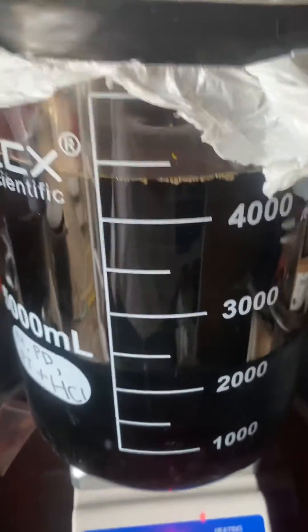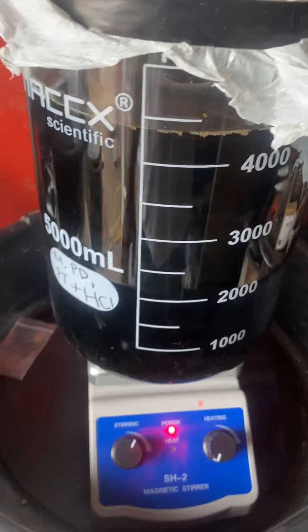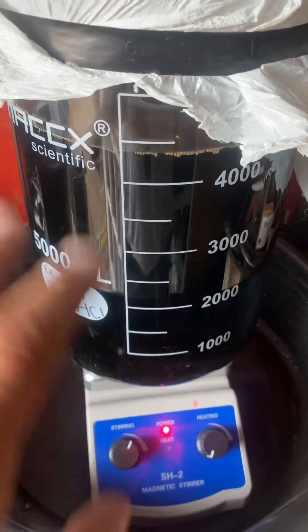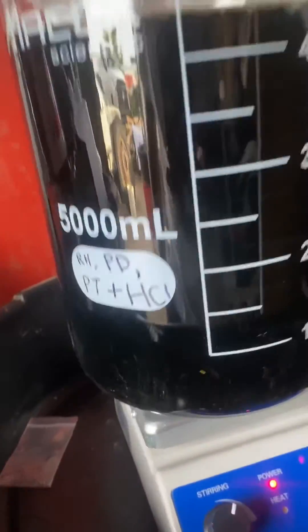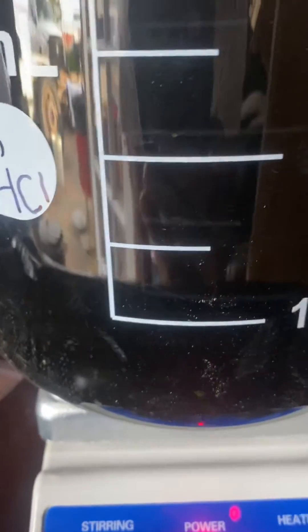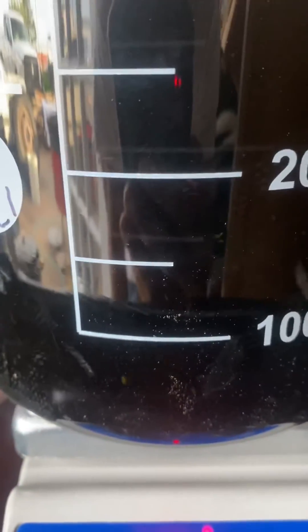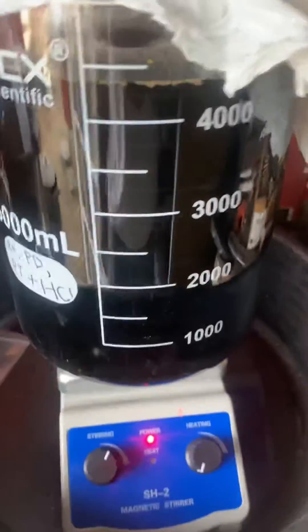I'll leave this here for a few days. You can see it's stirring pretty good — there's a cyclone in the center, like a little funnel. Once we get this done, hopefully all of our precious metals will fall out of solution. I can see it's starting to chunk up and mix around with the copper. Those particles floating around — I believe that's our platinum group metals: rhodium, palladium, and platinum binding to that copper and falling out of solution, turning into a platinum salt.